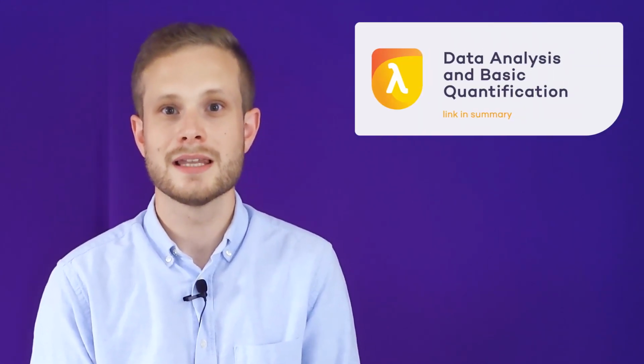So we've now covered lots of factors that can affect the way that you adjust or quantify your images. But believe it or not, there are actually even more. We won't go into those here, but for further comprehensive advice on how to acquire, adjust, and analyze your images, please refer to the Data Analysis and Basic Quantification course. Now let's go over to Jessica so you can learn about how to put all of this advice into practice.